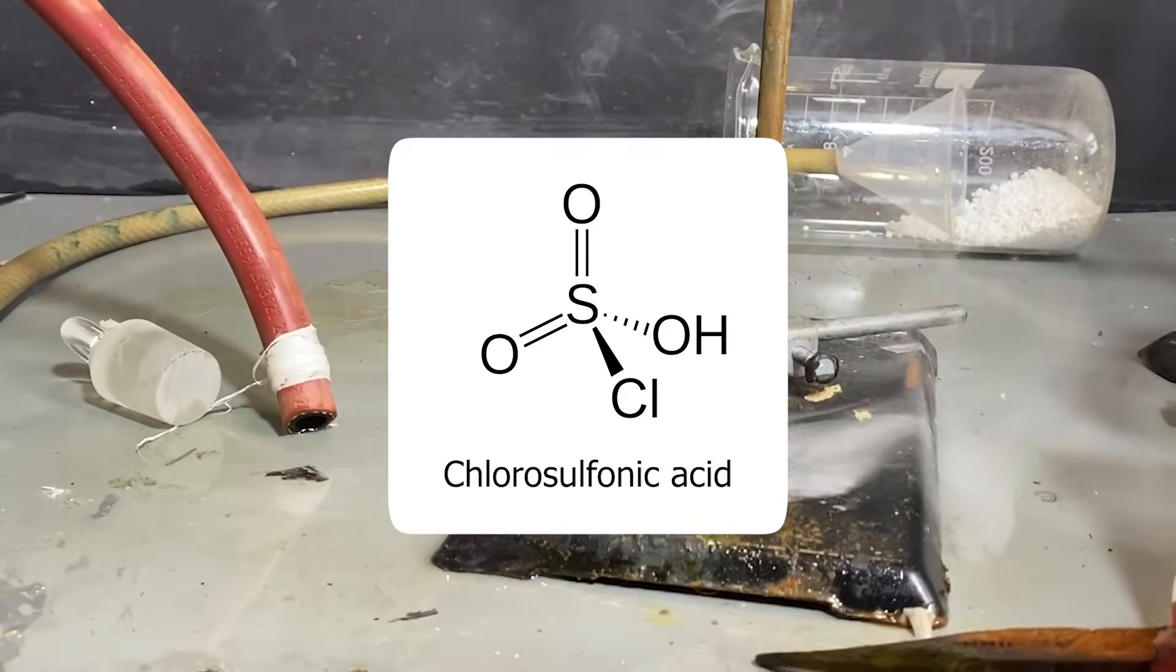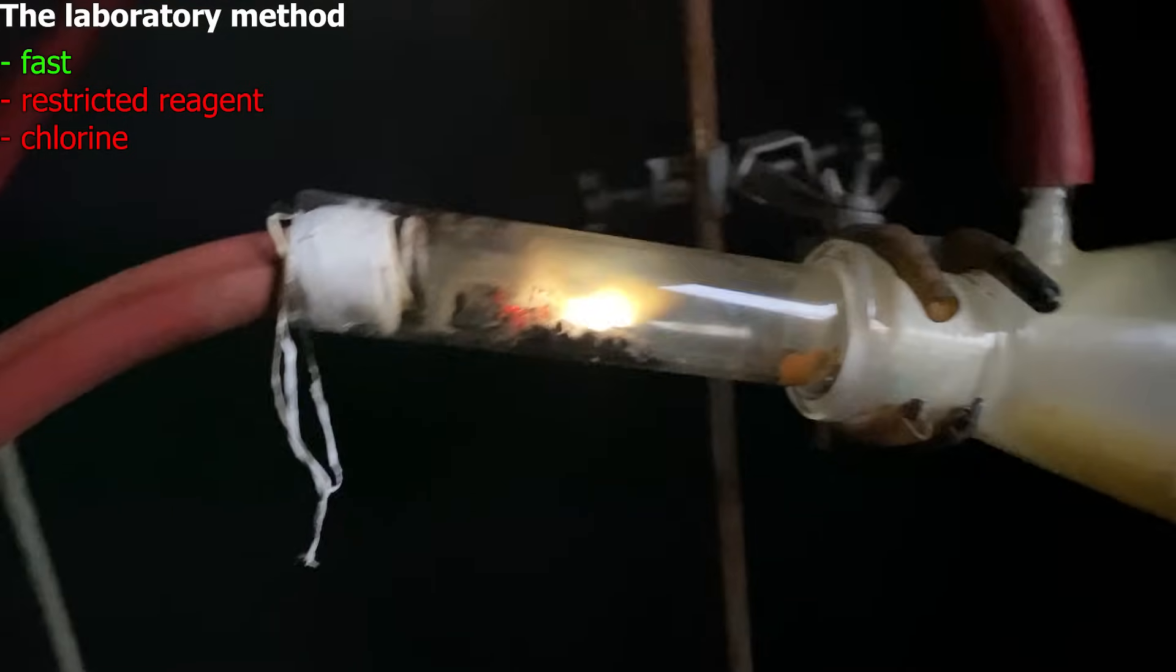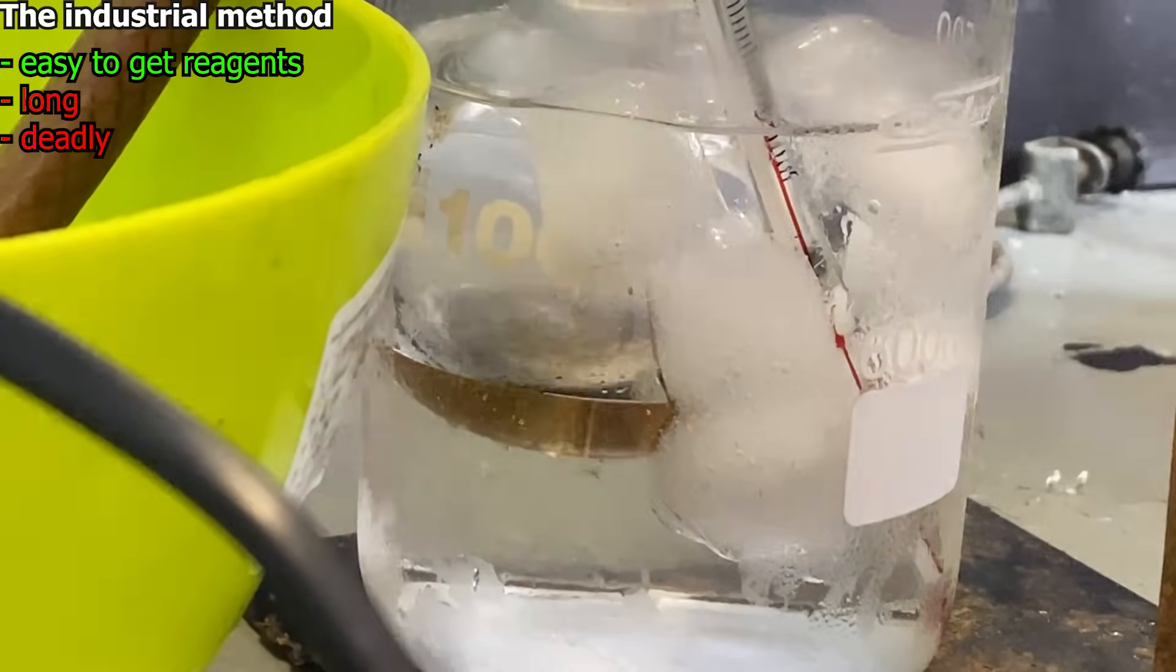This video will be making a superacid called chlorosulfonic acid in two different ways. In this exact order, the first one will be the classic laboratory method, and the second one will be the roundabout industrial one.